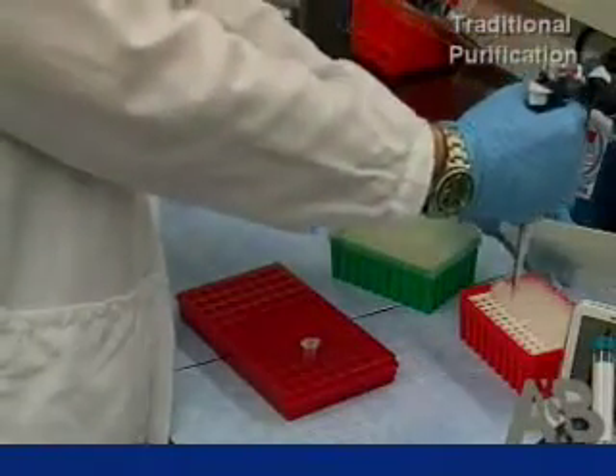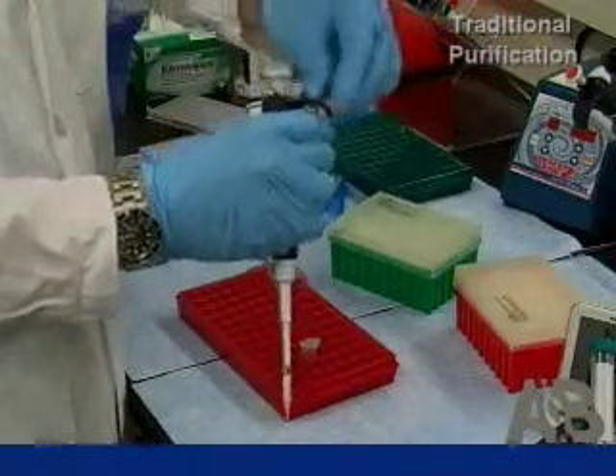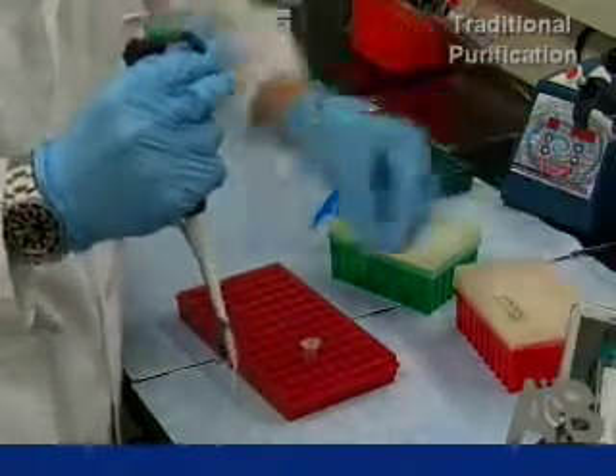Using the traditional RNA purification method, we're only at the binding-to-column step. We still have washes, elution, and a DNase digestion to go, and that can take 30 or most likely 60 minutes — and that's only processing 12 samples.